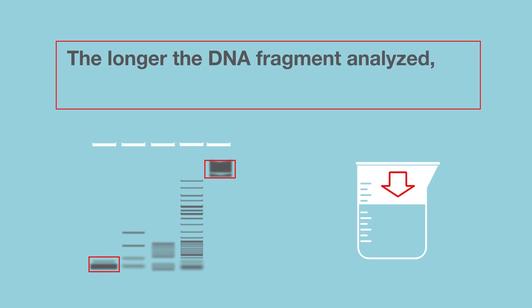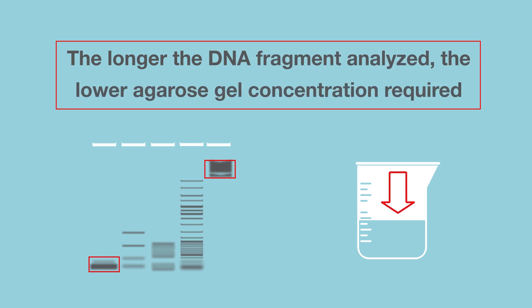Remember, the longer the DNA fragment being analyzed, the lower the agarose gel concentration required.